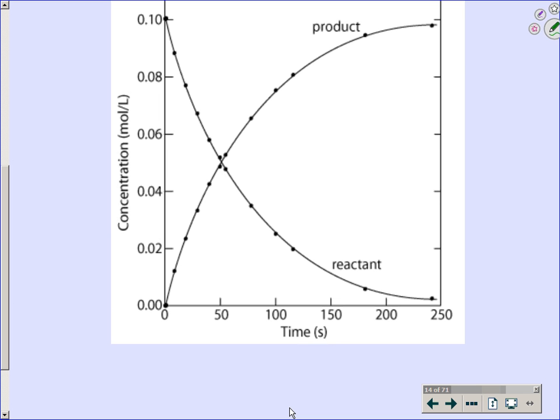So guys, you are smart cookies with math. You know this. Okay, so you're going from here to here. How does this slope compare? I could draw a tangent line and show the slope, but you can still see it. So there's the slope of the initial reaction versus this down here. What's happening to the slope over time? It's flattening out, so you're saying it's decreasing.